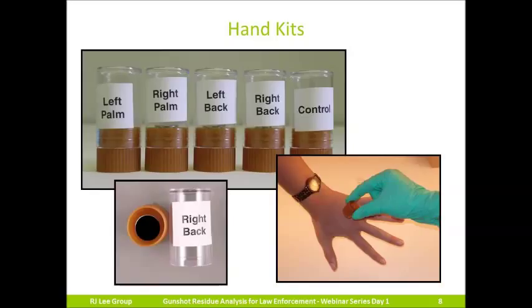It can be used to sample the area or room in which the samples are being collected to prove that it is free of GSR particles, or it can be used to sample the hands of the individual doing the collecting. Some agencies choose to use the control stub as a kind of batch control to prove that there is nothing present on the stubs before they are being used to sample. The use of a control stub is completely and totally up to you, but using them does help to bolster credibility in the courtroom. The first step is to prepare yourself before collecting samples.